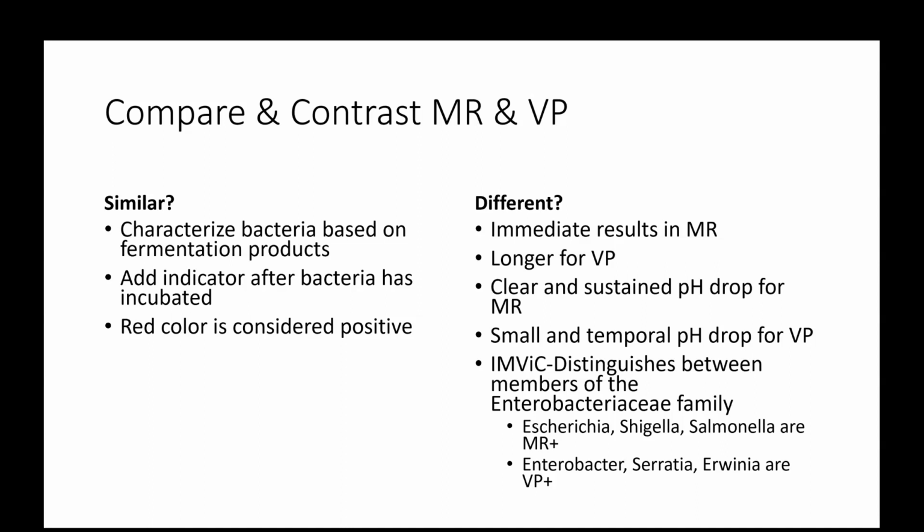So it's also important to point out here that, first of all, both of these tests are part of a very important set of tests called the IMVIC test. So IMVIC stands for indole, methyl red, Voges-Proskauer, citrate. So there are four tests, and I'll talk about this again in later labs. Indole, methyl red, Voges-Proskauer, and citrate.